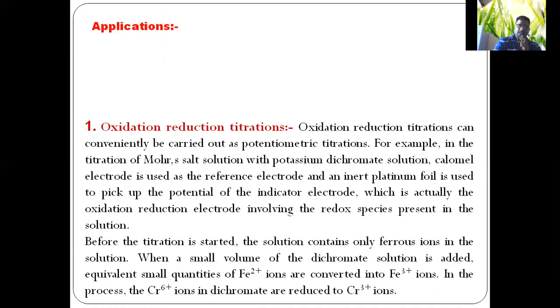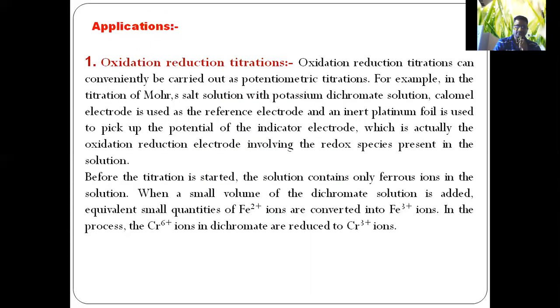So next, what are the applications for potentiometry? There are n number of applications for potentiometry. Let us take number one, oxidation reduction titrations, which you are going to do as an experiment in our chemistry lab. Oxidation reduction titrations.